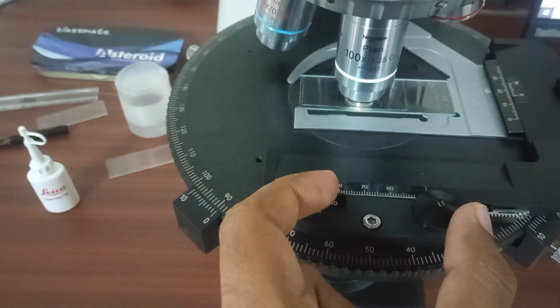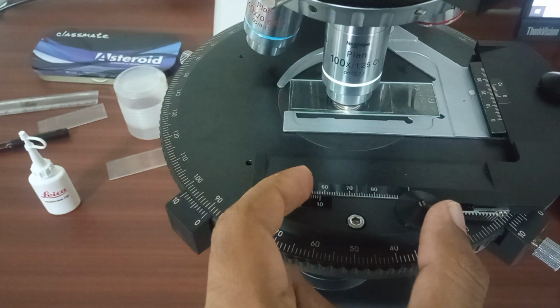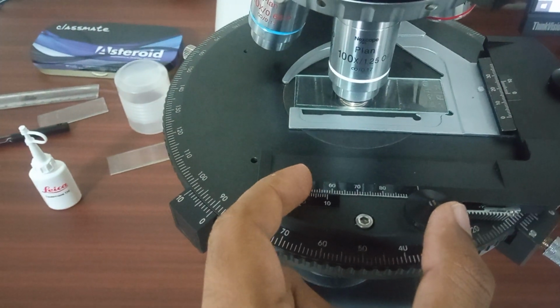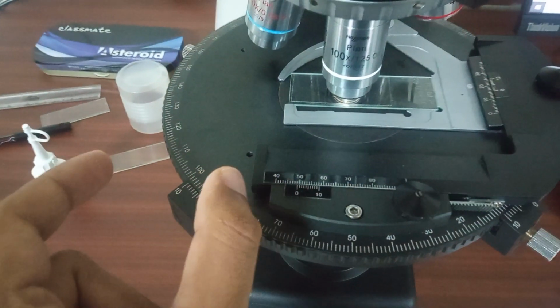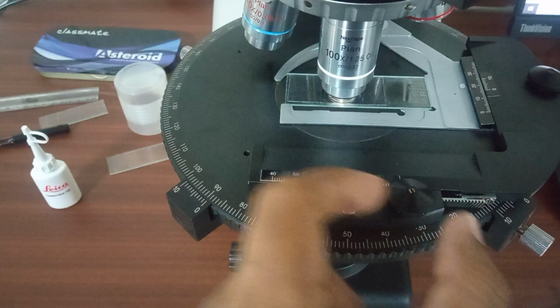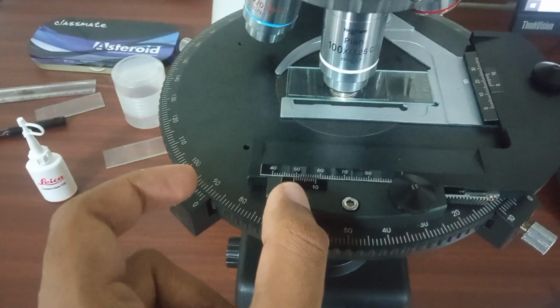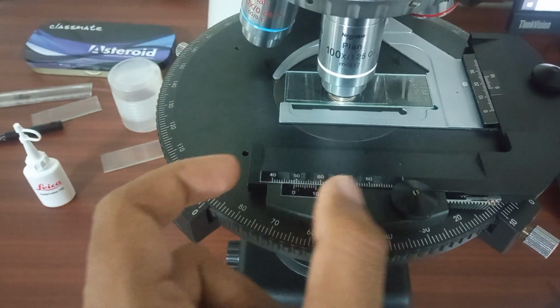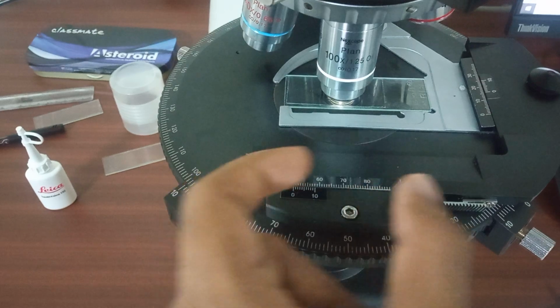Okay, if you have a slide here and you want to observe something from here to here, then you can move it clockwise. Then it will move your slide from here to here. So clockwise means it will move from right to left, and if you turn anti-clockwise, the observation slide will be moving from left to right.